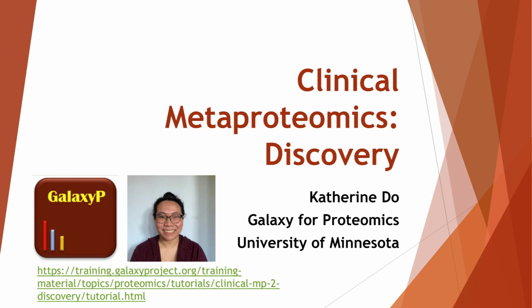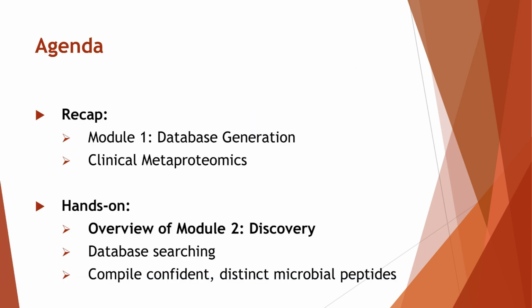So let's begin. The agenda for this video will be as follows. First, we'll cover a refresher of the database generation module, which will lead us into discussing where we are in the Clinical Metaproteomics tutorial. Then, in the hands-on section, we will discuss the discovery module and start its workflow, which involves database searching using two peptide identification programs, managing their outputs, and compiling a list of confident, distinct microbial peptides. That will set us up for the next module, which will be peptide verification.